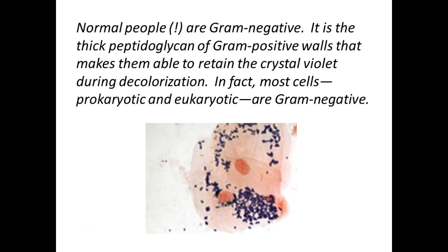Even among bacteria, there's a group that don't have cell walls. What would they come out? If we completed the gram stain all the way through, they would be pink. No cell wall, no trapping in crystal violet iodine. They won't stay purple. They'll end up decolorizing and then staining with the safranin, so they'll be pink.